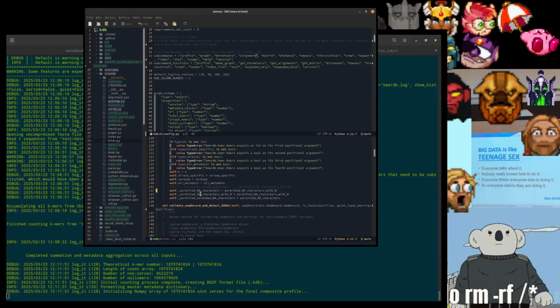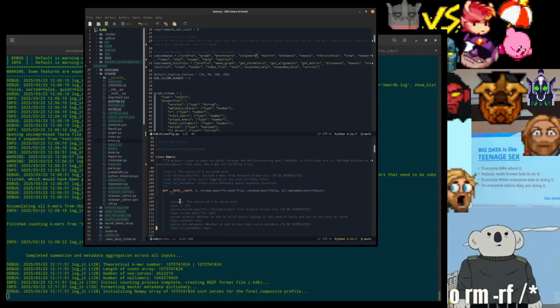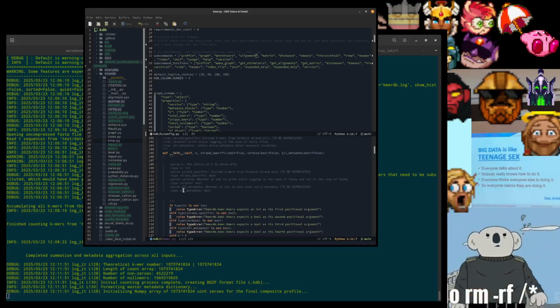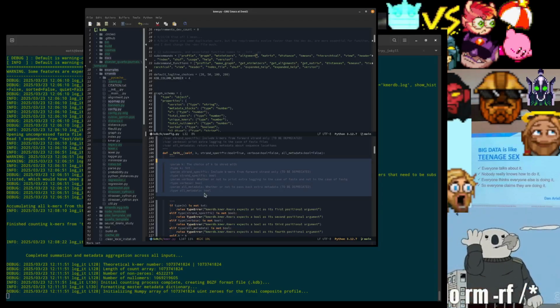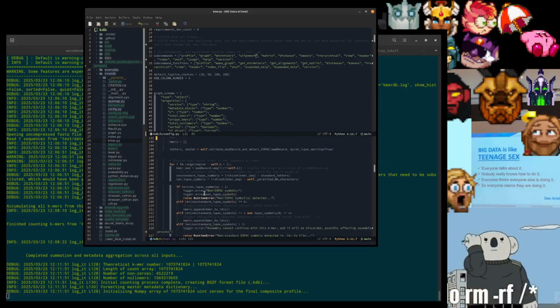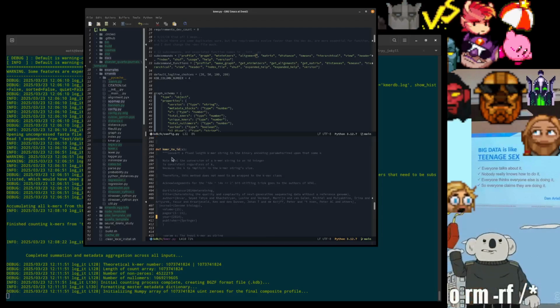So again, back to this. Most of these modules have doc strings with description of the parameters and return types. That's not stuff most people use. This one is.